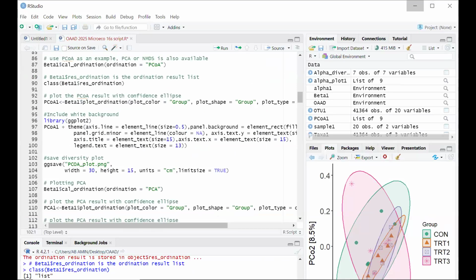As you can see, Dr. Junwo is saying going well so far. So please, if you are following, can you be indicating that so that we know that you are going with the presenter. Okay, I'm moving so fast. No, not you, sir. I'm saying that the people can be showing in the comment that they are getting it. If I'm going too fast, please let me know.